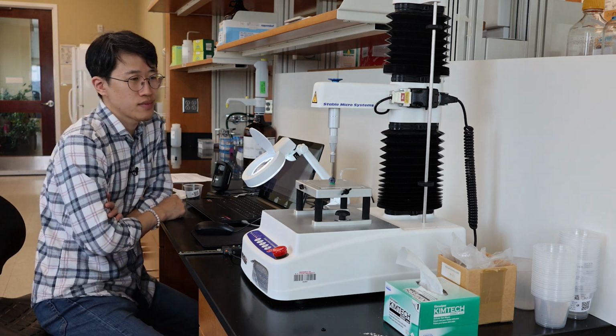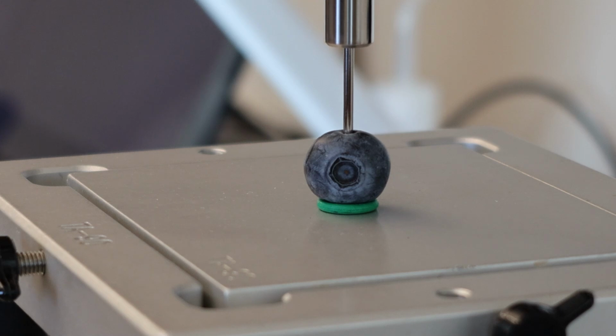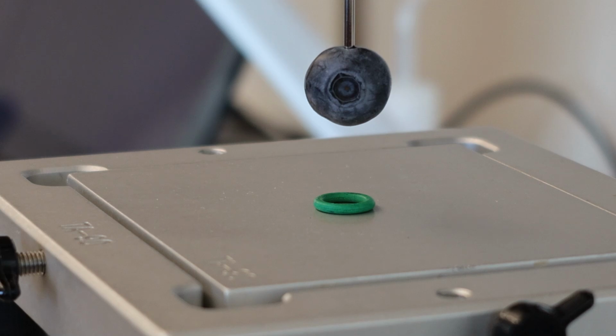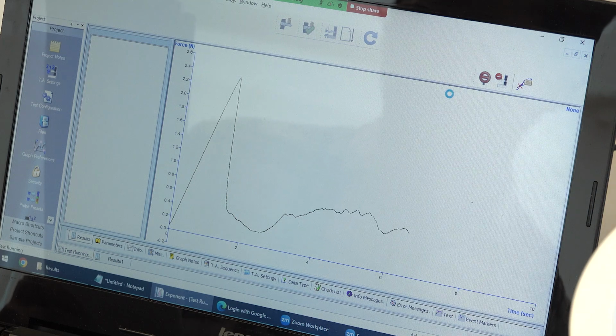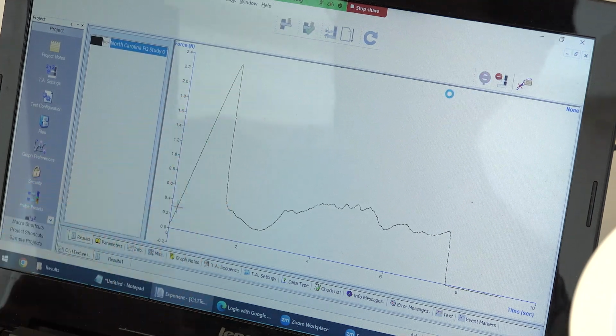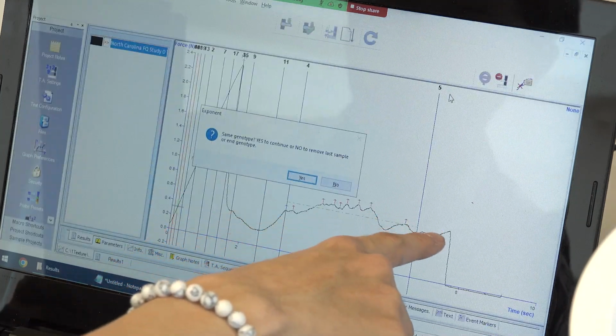How it works is that it has a probe that slowly goes down. You could have it compress the fruit a little bit, or you could have it puncture the fruit, depending on the method that you're using. And then the probe goes back up. The force or the resistance that the probe is receiving from the fruit is recorded along the way in the form of a graph like you see here. The force goes up at first, it's at maximum force right when the skin breaks, and then the force goes down rapidly. After that, it's the internal part of the berry.